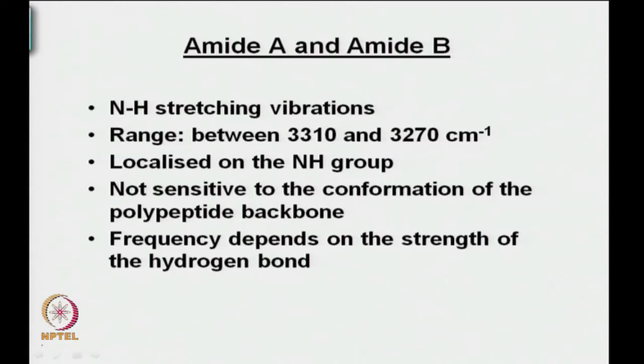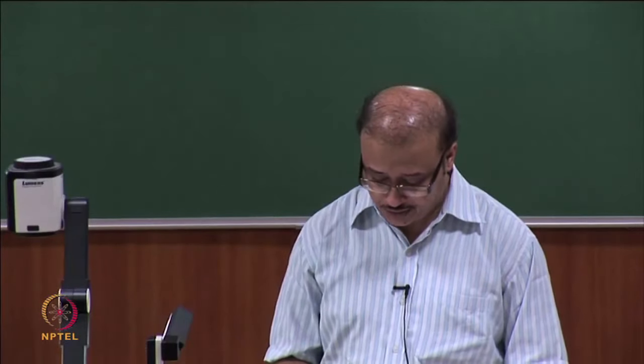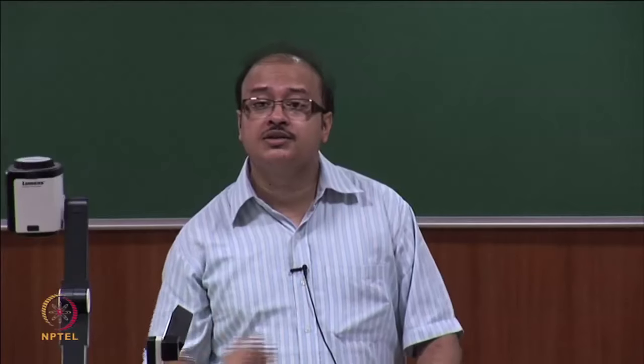So, you can understand, if you change solvents, it would be affected by the solvent, because that is how your hydrogen bonding interactions would change. Now, what about amide 1? As I said, this is the one we are going to be primarily concerned with.